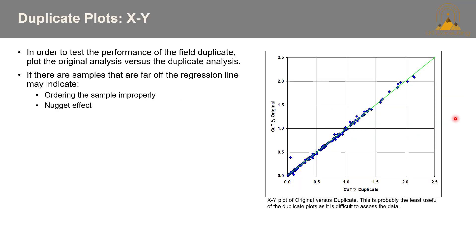The XY duplicate plot is a very simple plot whereby you plot the duplicate versus the sample. If samples are far off the regression line, it could indicate that ordering of the sample was done improperly — for instance, your duplicate for sample 33 was placed in position for sample 60 — or it could be due to a nugget effect. It's considered a least useful plot because it's really difficult to assess the data, as it would be onerous to investigate each point individually.